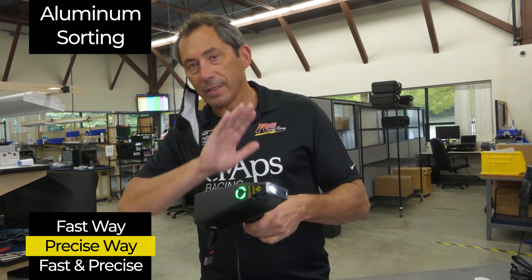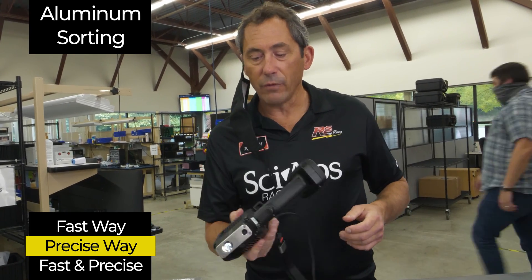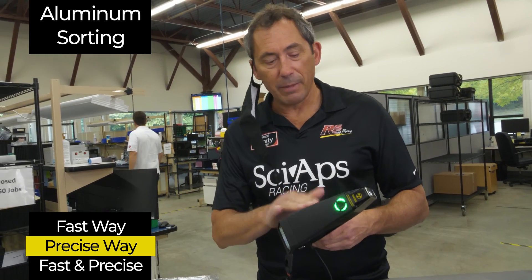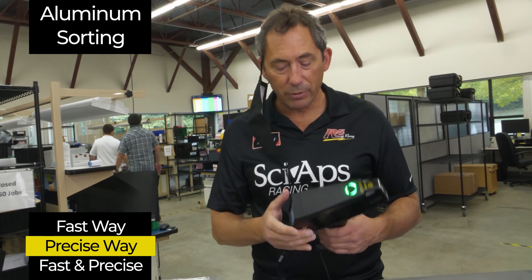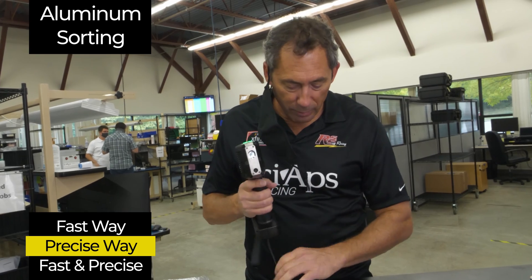As I said in the last video on the fast sorting, this is the new x-ray. It's the smallest, lightest one ever made. It's got a beautiful metal frame, very durable, handles heat beautifully — just a joy to use all day long. You heard that pitch before, we don't need to repeat it anymore.